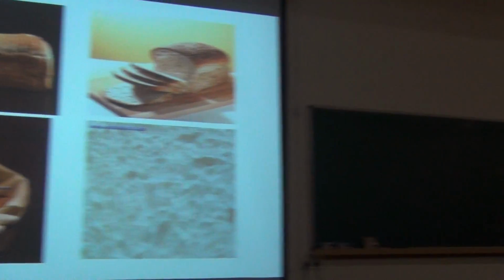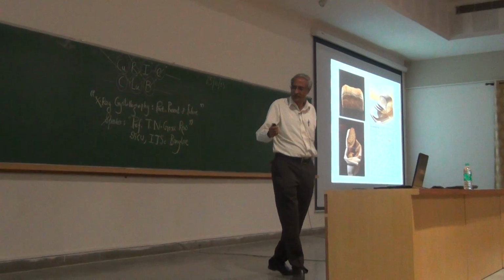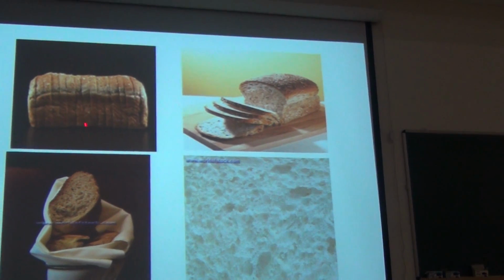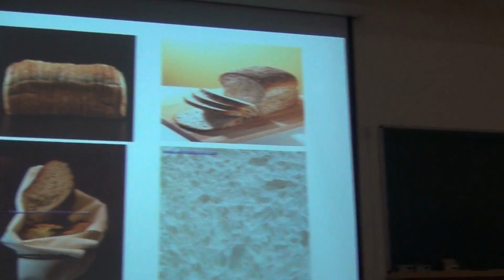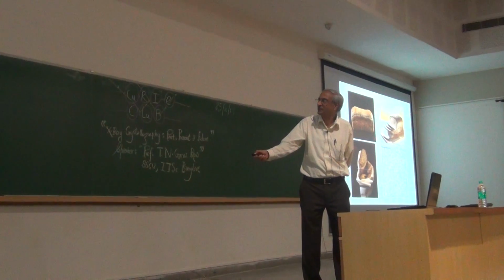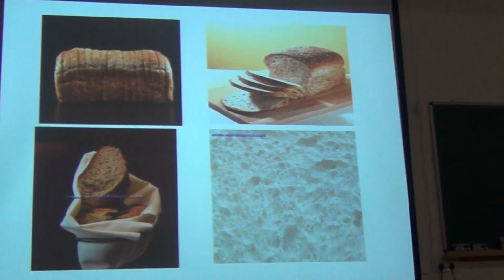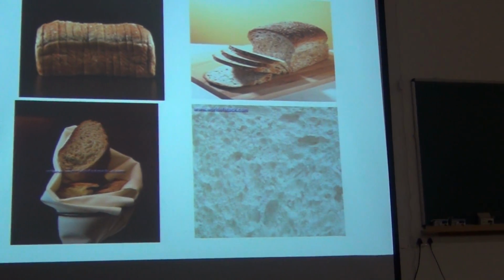If you want the 2, 0, 0 diffraction, what you have to do is cut it exactly at the half point and remove the central slice. The central slice will represent 2, 0, 0, and then 3, 0, 0 will be the 1/3 slice and 4, 0, 0 the 1/4 slice and so on. So we can now get all the Miller indices in that direction.